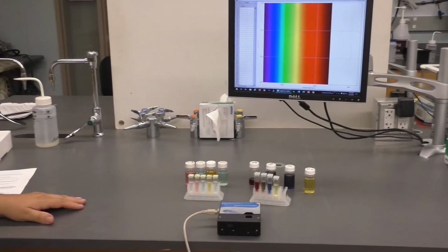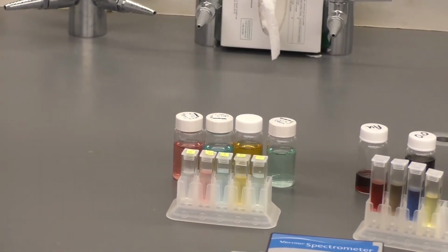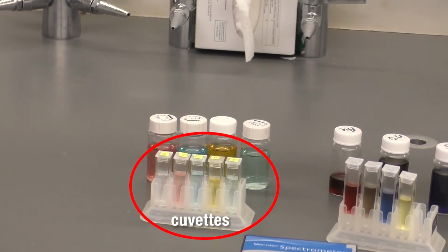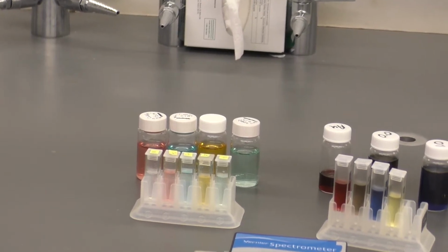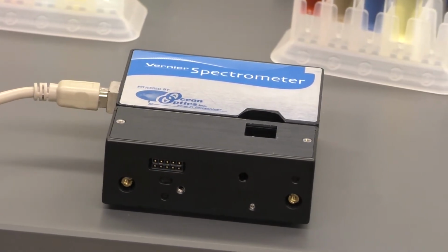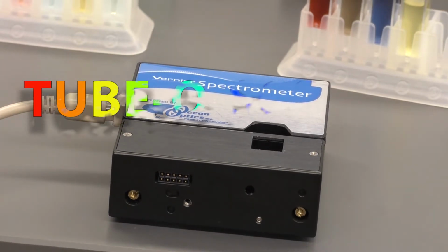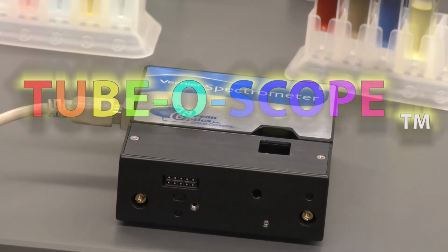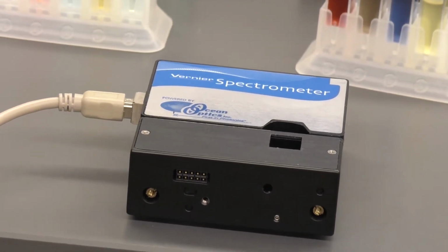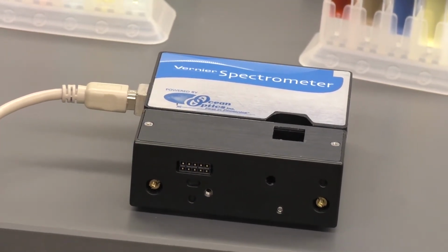So we can see down here, we've got our metal ion salt solutions in little vials, and then we actually put them in these little rectangular containers that are called cuvettes. And so we've got the 4 colored solutions, and what we want to do is put them into a spectrometer. That's this device right here. It's just a really fancy version of what we've already used in lab, the boxoscope and the tuboscope. The difference is it's got some electronics attached that allows it to record the absorption of the solution at every single wavelength, somewhere between 400 and 700 nanometers.